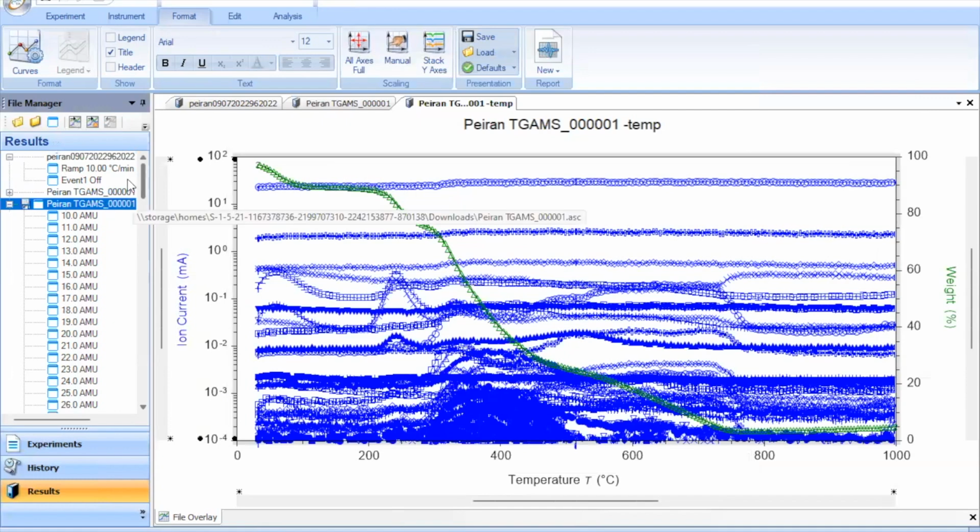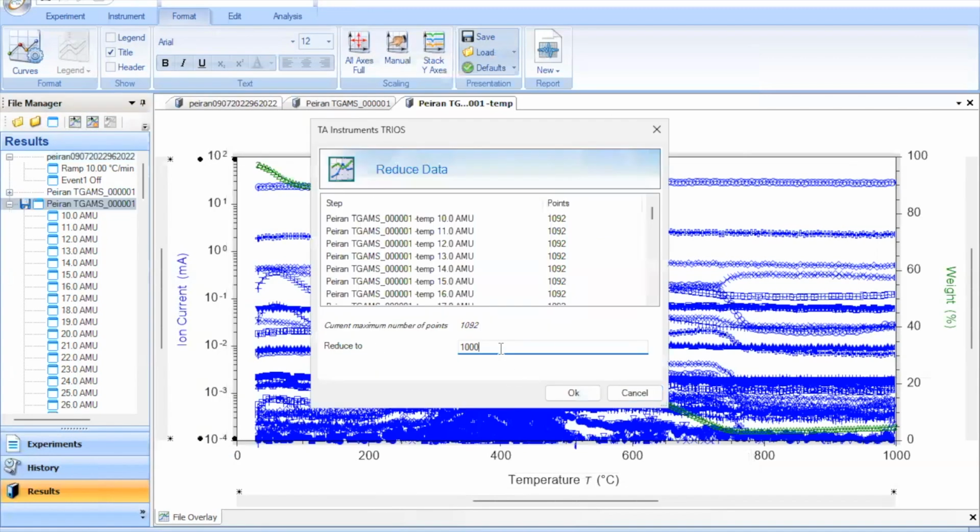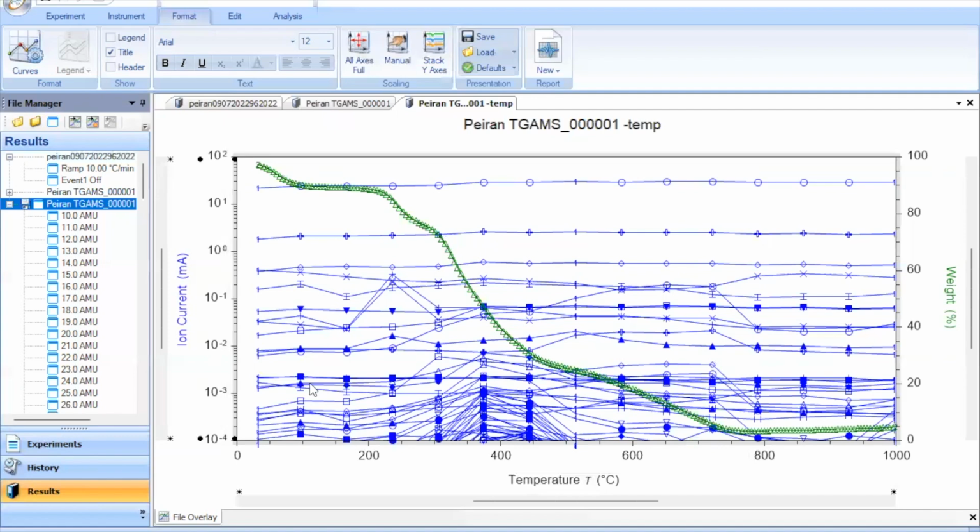So we'll go and highlight the file overlay data set, and we'll go down to Transformations and click on Reduce. I usually do between 10 and 20. In this case, we'll try 15. Perfect. So there's a lot less mess going on with the data points, so we could see more of a general trend that is occurring.